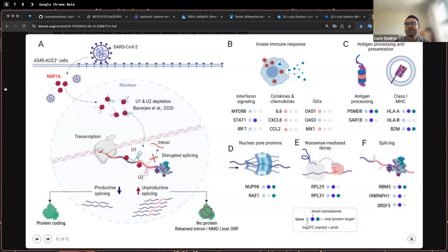And like I said, this is the analysis of already published data. So there's a lot of biology that can be unraveled from any RNA experiment, because the amount of data generated by RNA-seq experiments is really hilarious. One paper is never going to explore all the possibilities of one data set, not even diving into the single cell part of that.